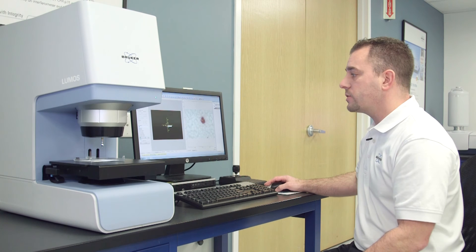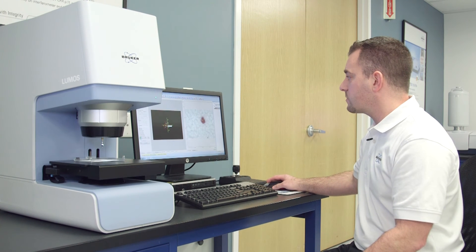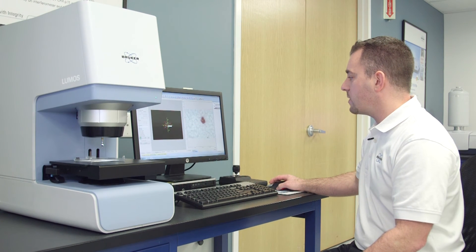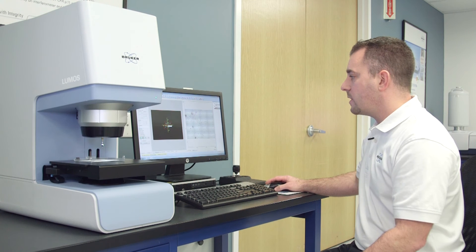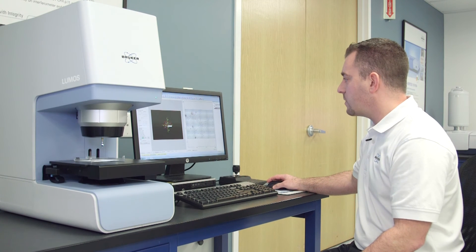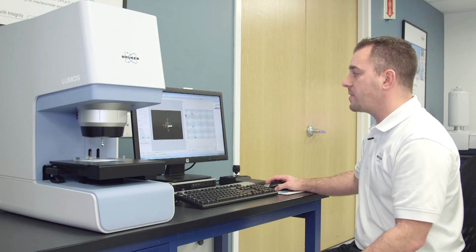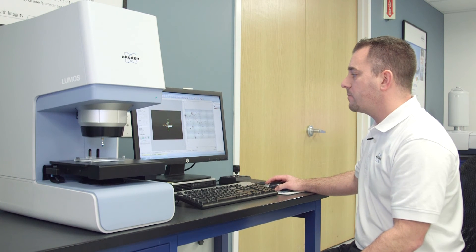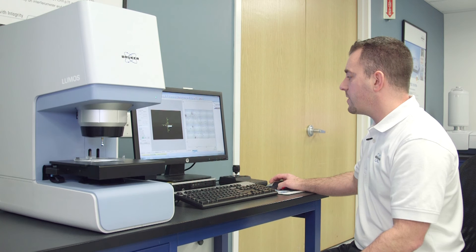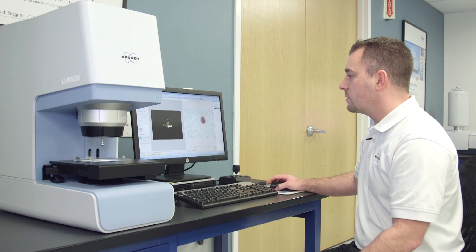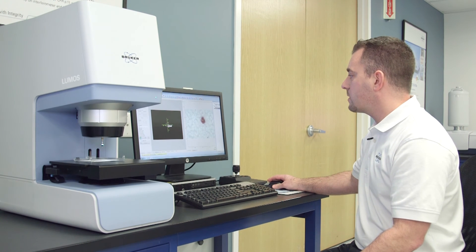Now here I can choose discrete positions, discrete points. I can switch to my overview image. I can choose a line array, although this is not a particular sample for that type of measurement or even a mapping experiment as well. But in this case I'm going to again go right back to my zoom position. Go to my discrete point. Click on my sample.